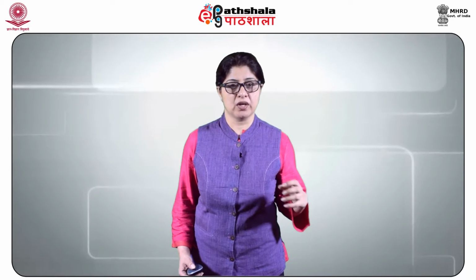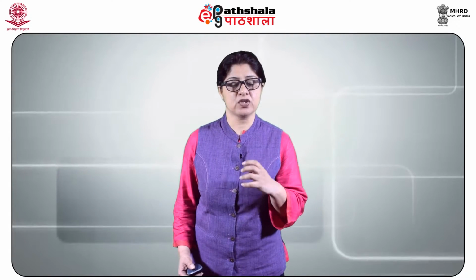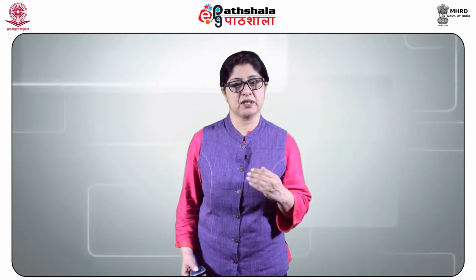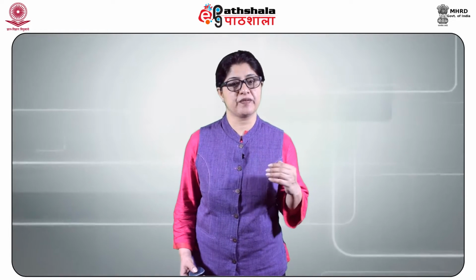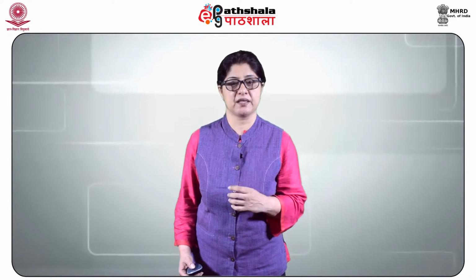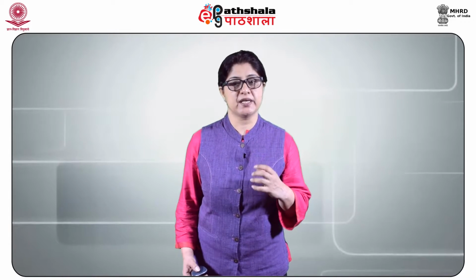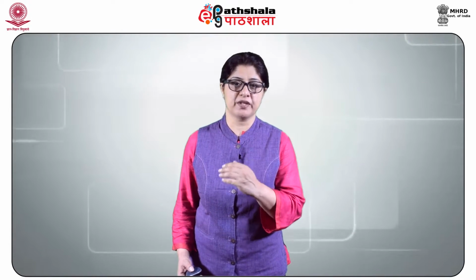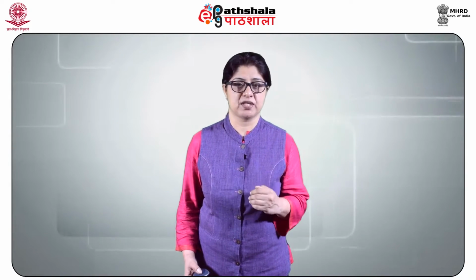In SCOT columns, the column walls are first coated with a thin layer, about 30 micrometers thick, of the adsorbent solid such as diatomaceous earth, a material which consists of single-celled sea plant skeletons. The adsorbent solid is then treated with the liquid stationary phase. While SCOT columns are capable of holding a larger volume of the stationary phase than the WCOT column, due to its larger sample capacity, WCOT columns have better column efficiencies.